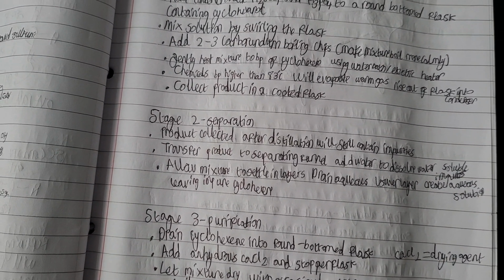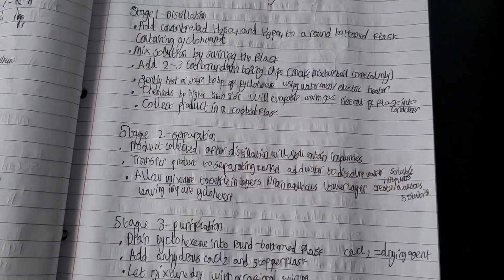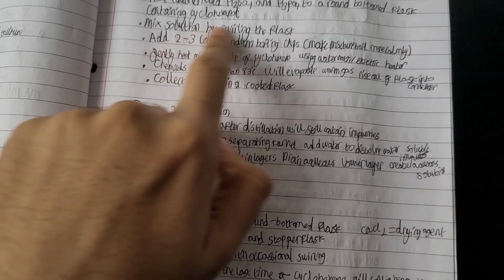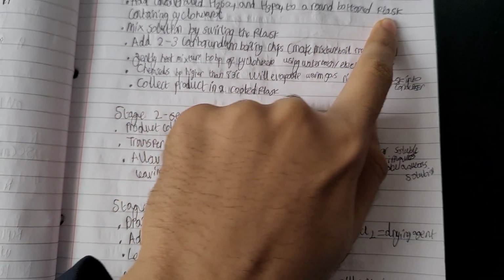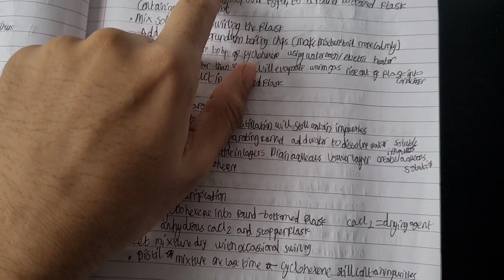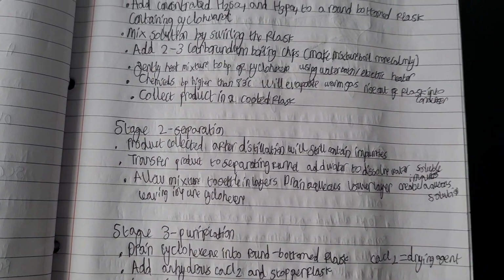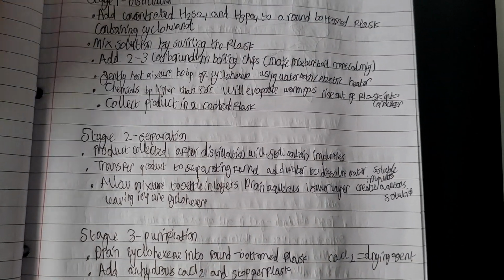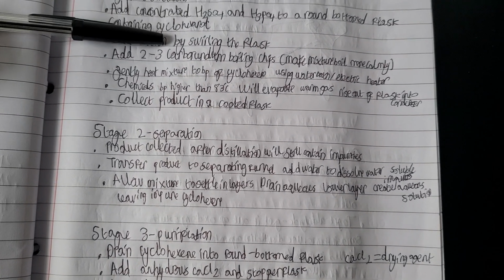So you've got 3 stages. Stage 1, distillation, producing cyclohexene from cyclohexanol. You want to add concentrated H2SO4 and H3PO4 to a round bottom flask containing the cyclohexanol, because we're trying to produce the cyclohexene, we don't have it. You want to mix the solution.